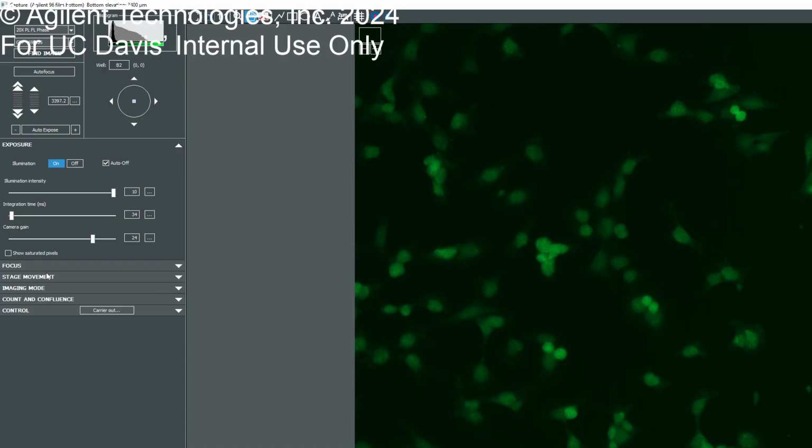And you can imagine, you can use the same Z height for each FOV, or field of view, for different channels, but it's not really the case for high magnification images. What I mean by that is if you have your nuclei and your mitochondria, those could be at different heights, right? So we always want to autofocus on each of the channels. And once we do that here, it's going to remember those settings and input those offsets automatically when we go to the experiment.